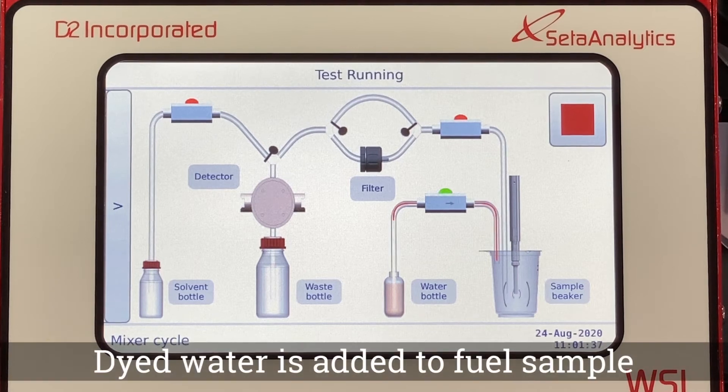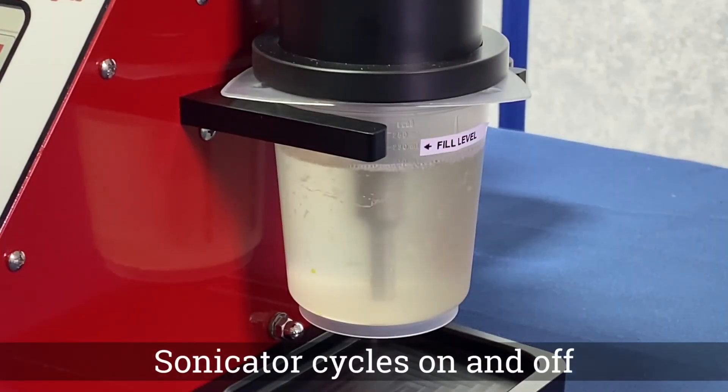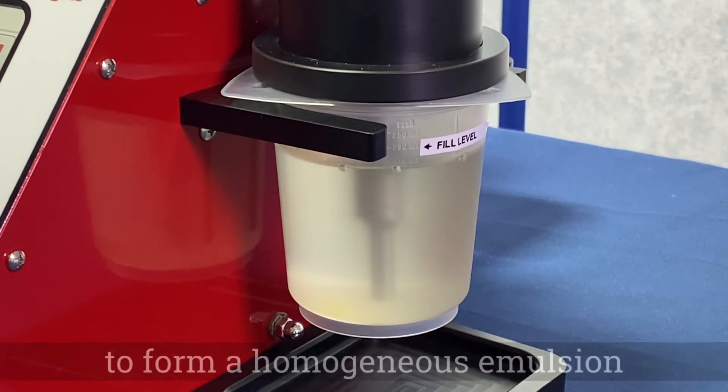With the sonicator running, dyed water is added to the fuel sample. The sonicator cycles on and off to form a homogeneous emulsion.